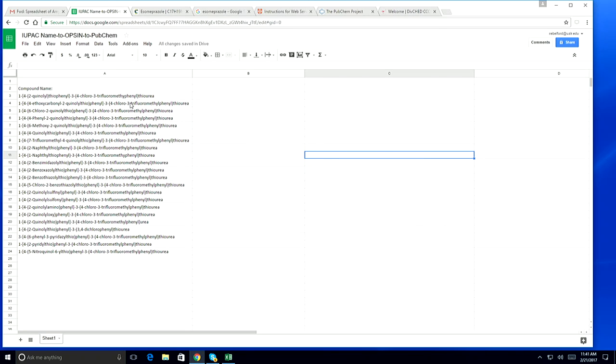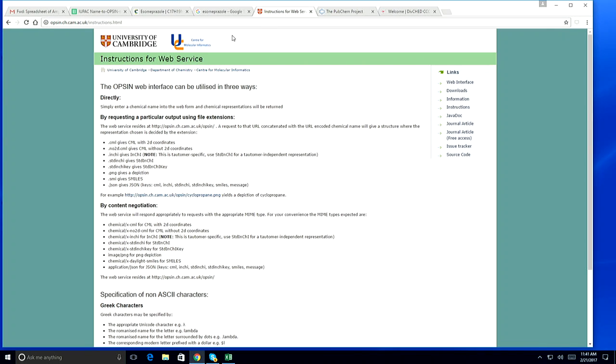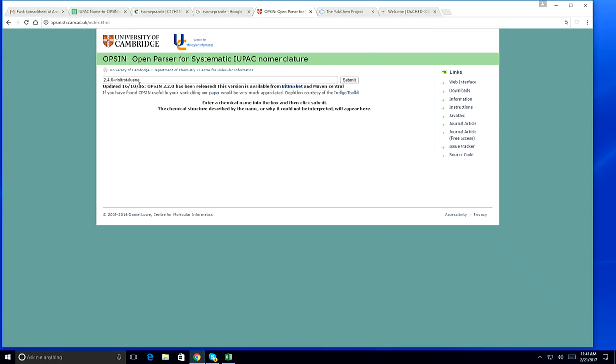Greetings. In this video, I'd like to take this list of IUPAC names and link them directly to their content within PubChem. I'm going to use the OPSIN service at the Center for Molecular Informatics at the University of Cambridge. First I'll take the name and convert it to an InChI, and then upload the InChI to PubChem.